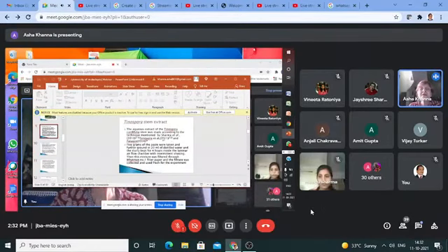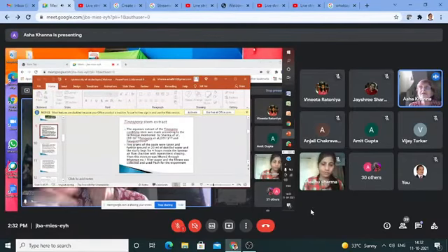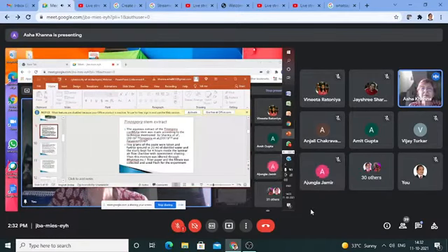The techniques दिए हुए हैं यहाँ Sharma et al. And Sengupta et al. Now the 5 grams of the paste was taken and further ground in 20 ml of distilled water into a slurry, and this was kept for 4 hours in the laminar flow chamber, and after that it was filtered with Whatman number 1 filter paper and it was used fresh. इसको फिर fresh हमने use किया था. Okay.